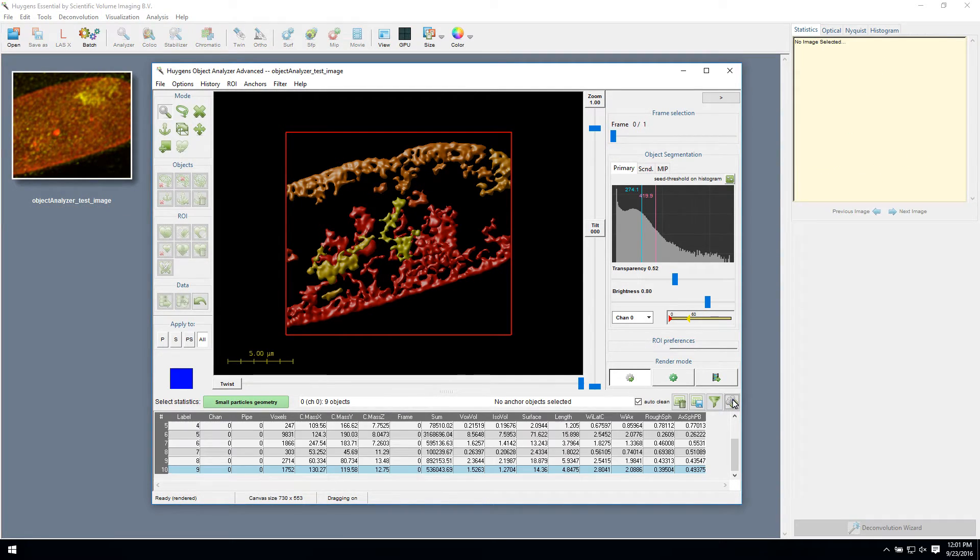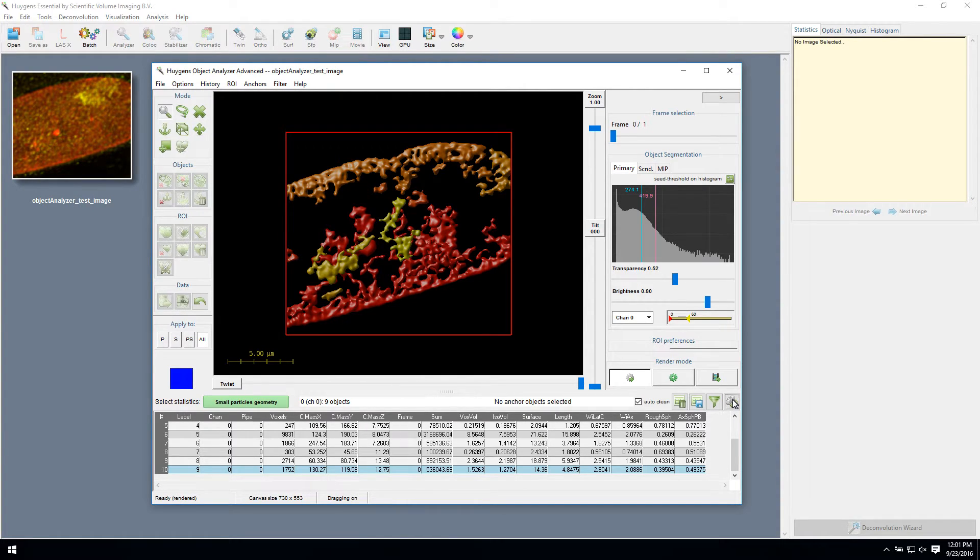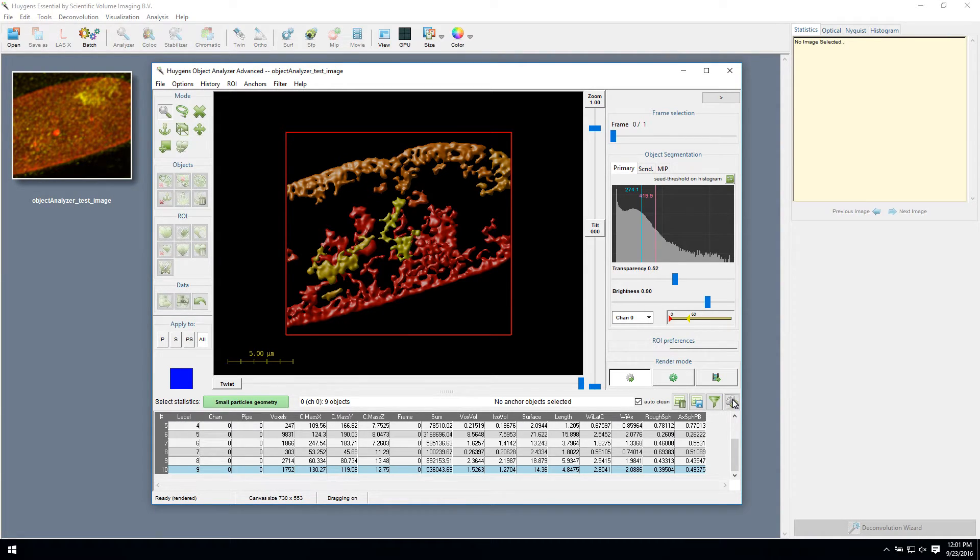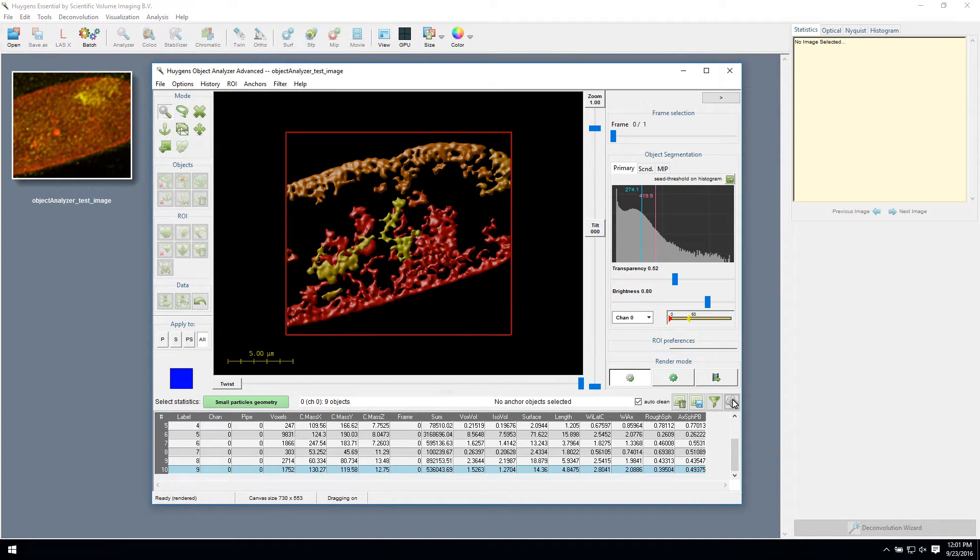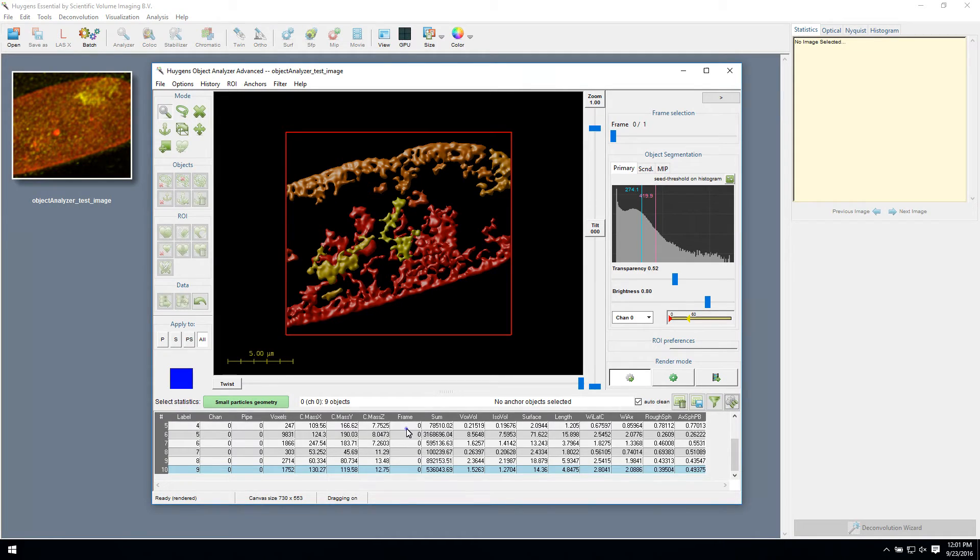Any measured parameter can be used to filter objects out, based on geometry, distances to neighbors or references, location, co-localization and so on. If you select the row in the list of statistics, you will see the object it applies to light up, and the other way around.